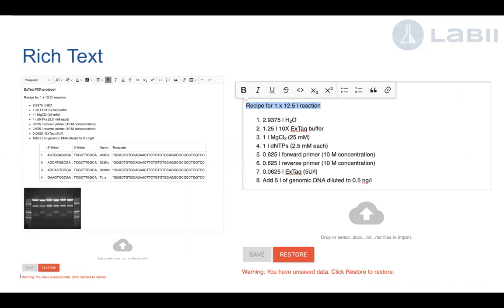And then the first category is about Office. We have already put in a lot of time to develop widgets to replace the Word document or the Excel, which means you can edit all of this directly online from your laptop, tablet, or cell phone. So we have a rich text widget, which, as you see over here, basically supports all Word documents, including images, pictures, tables, all different kinds of things. There are different formats. For example, on the right side, this one does not have the toolbar, and you need to select the text. This is a little bit lighter compared to the previous one.